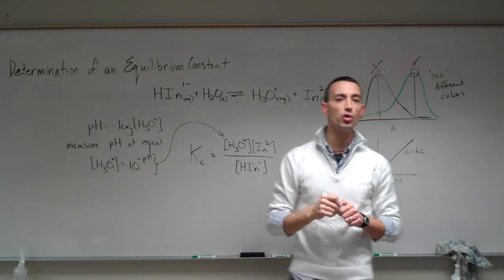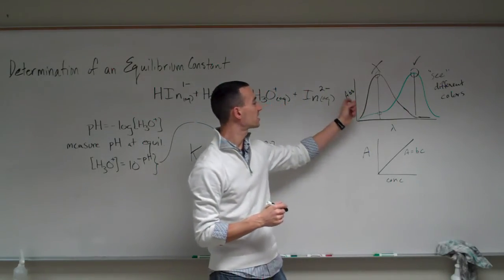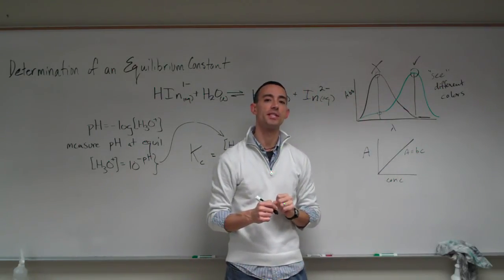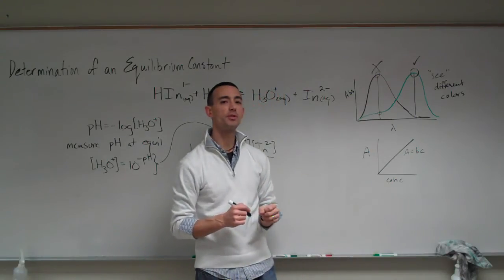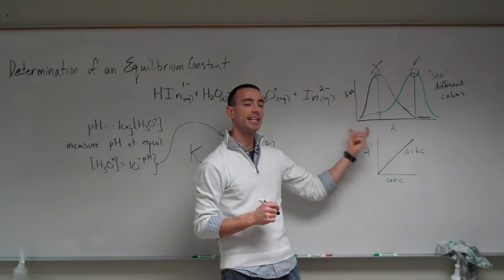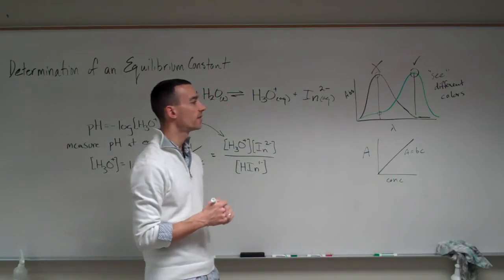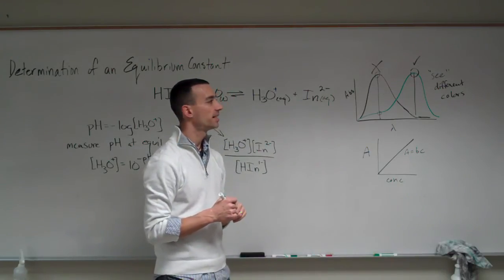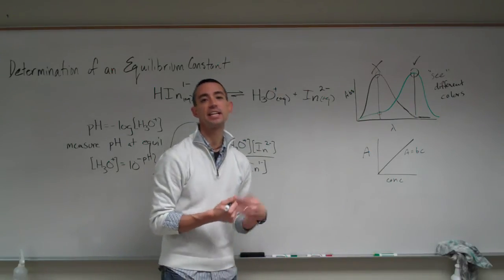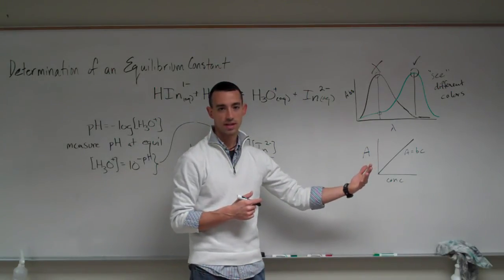The reason you're seeing two different colors is because of what's getting absorbed. That's what this tells us. What colors are being absorbed by the two different solutions that we see. So when one solution absorbs very short wavelengths, 400s and 500s, it's taking out or absorbing the blue colors that are in white light, visible light. And so what's left and not absorbed is the color that is reflected and that your eye sees. So that solution should appear reddish yellow, most likely.